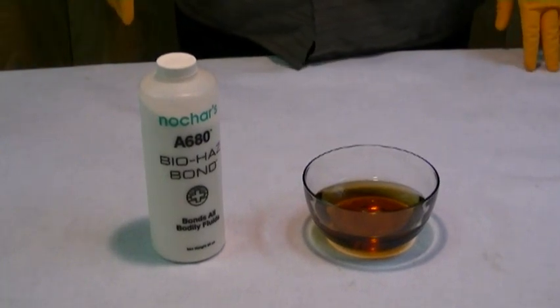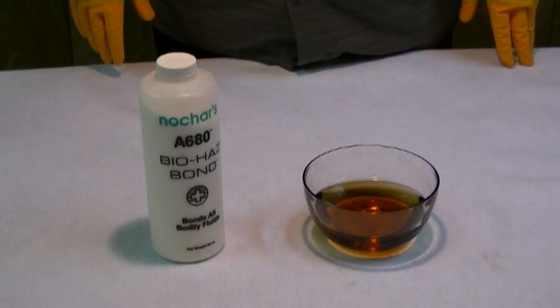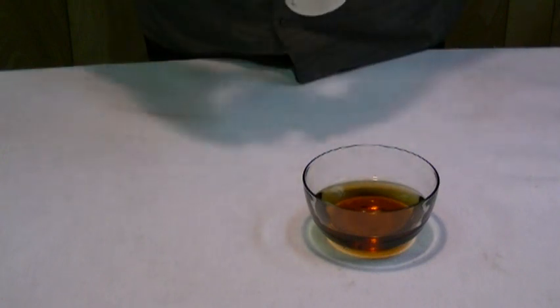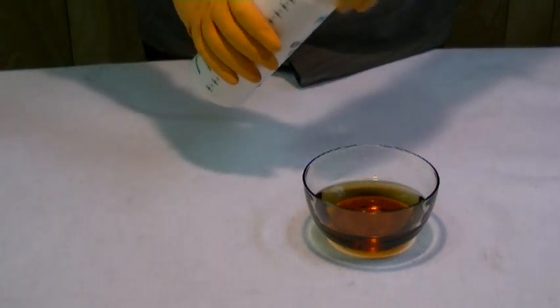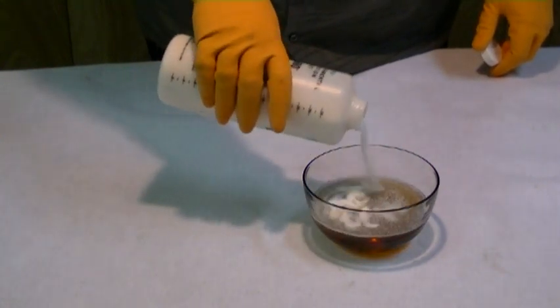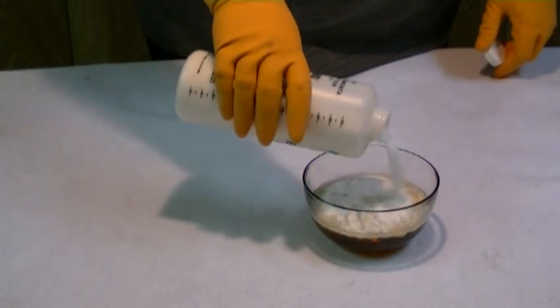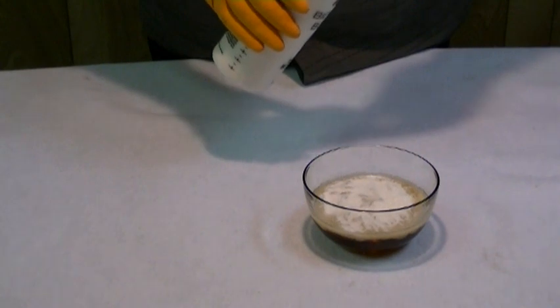In this video clip, we're going to demonstrate Nochar's A680 BioHazBond. And as you can tell by the name, this product is designed to solidify any type of body fluid. In this particular demonstration, we're going to use coffee to do the test. Like body fluids, coffee is mostly water and a relatively small amount of solids.